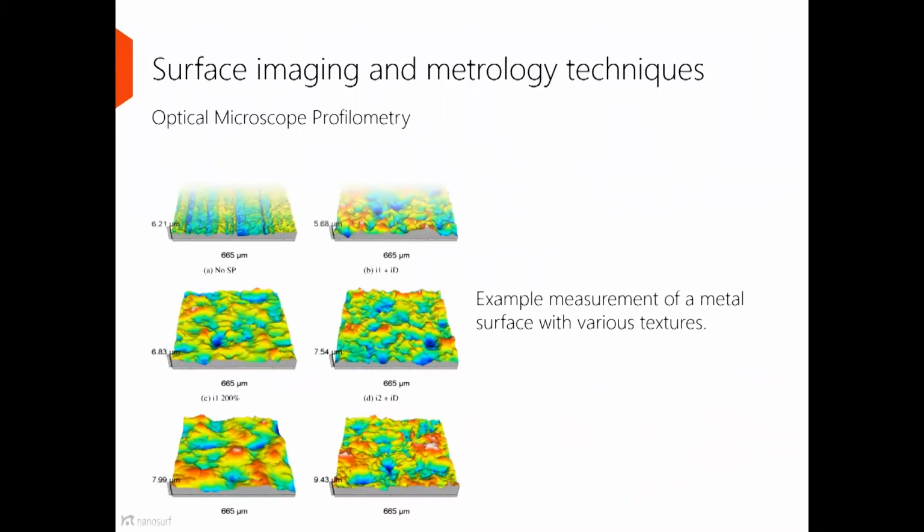And what you'll notice is that when we collect the data with our optical profilometer, we will get something that looks like an image. It will be false color contrasted and encoded with Z dimensions. So you'll notice in each of these images here on the left, we actually have a Z dimension that's now measured on our scale bar to go along with our XY measurement. We can measure a variety of textures, and we can quantify these textures. And again, we can both qualitatively look at them, and then we can quantify the differences between each of the samples here for further measurement.